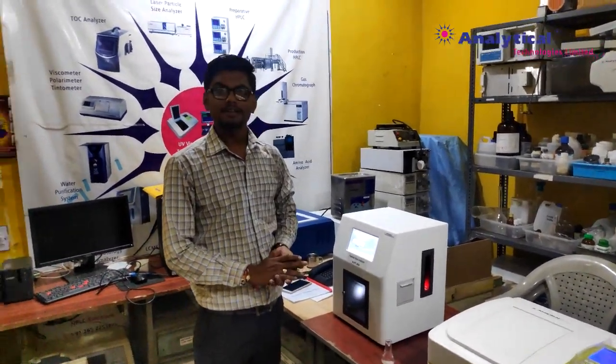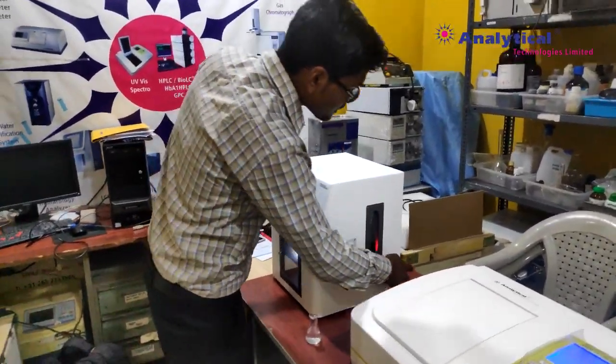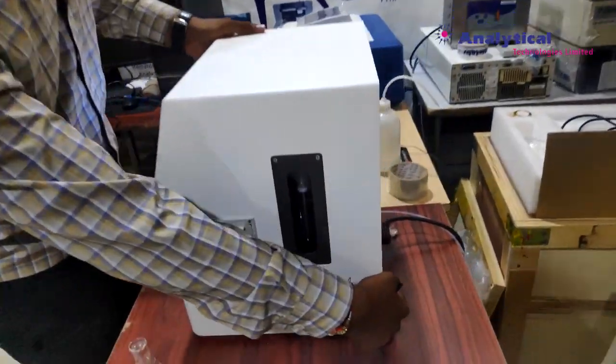Hi, this is a practical demonstration of analytical laboratory technology. This is the new testing apparatus for this device.